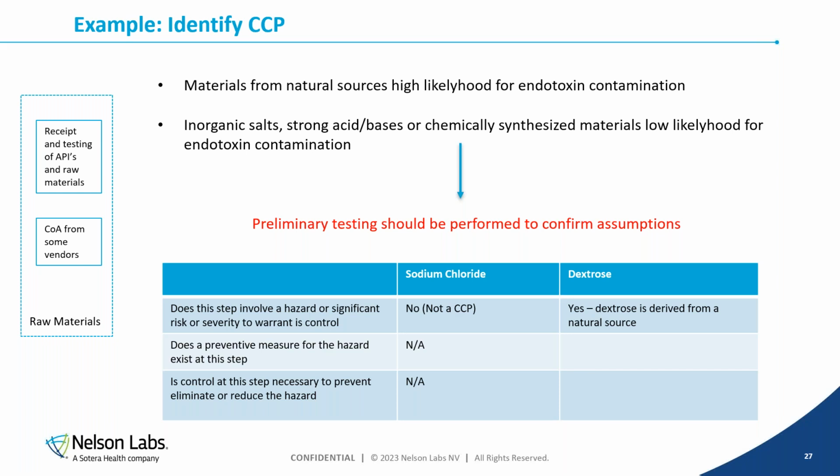If we now use these assumptions, I'm going to show you only sodium chloride and dextrose because they are very much different. If you pose yourself the first question from our decision tree: sodium chloride is an inorganic salt, so probably it will not contain so much endotoxin. What you should do then is test a few batches of your saline, and you will find out that this assumption is true. So does this step involve a hazard or significant risk or severity to warrant its control? The answer to this question is no, so it's not a critical control point.